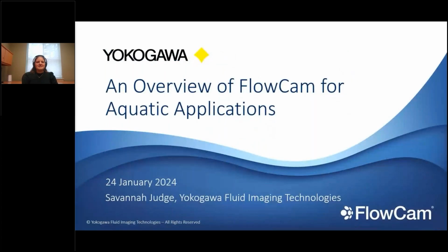So let's go ahead and get started. Today we're going to be providing an overview of FlowCam for aquatic applications. So aquatic is a really broad term, and in this case it refers to many different facets of aquatic science that spans from marine to freshwater systems.